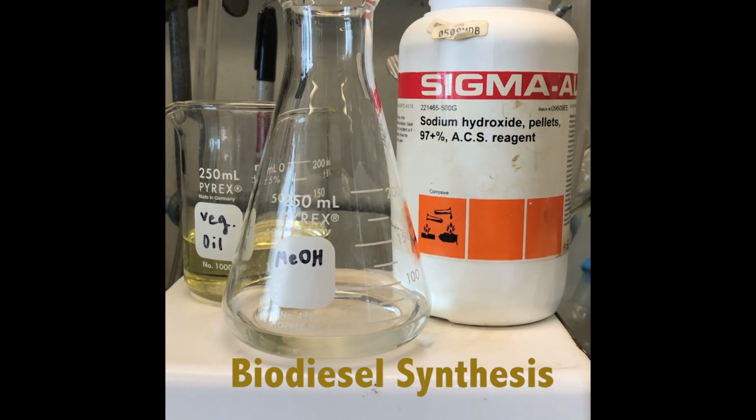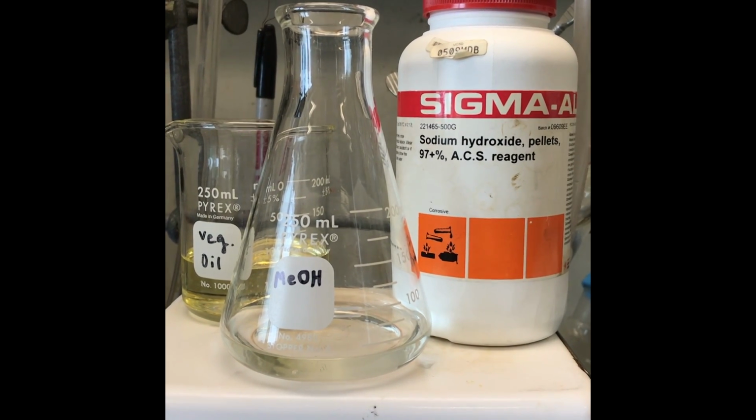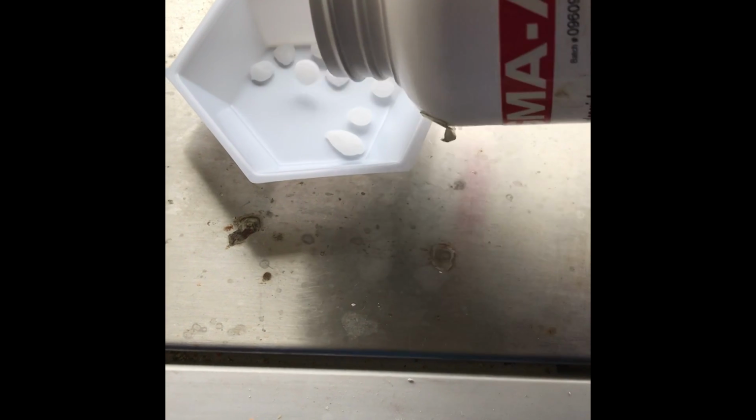The synthesis of biodiesel is relatively easy and straightforward. It only involves vegetable oil, methanol, and sodium hydroxide. First, sodium hydroxide pellets are weighed out.